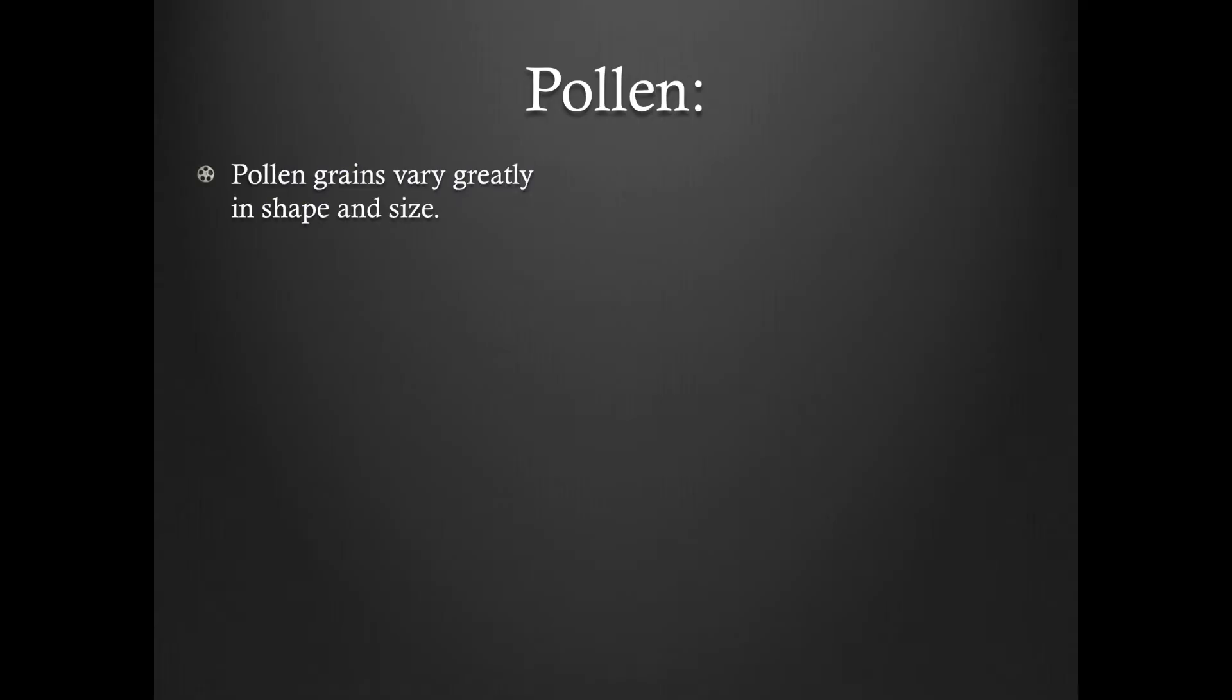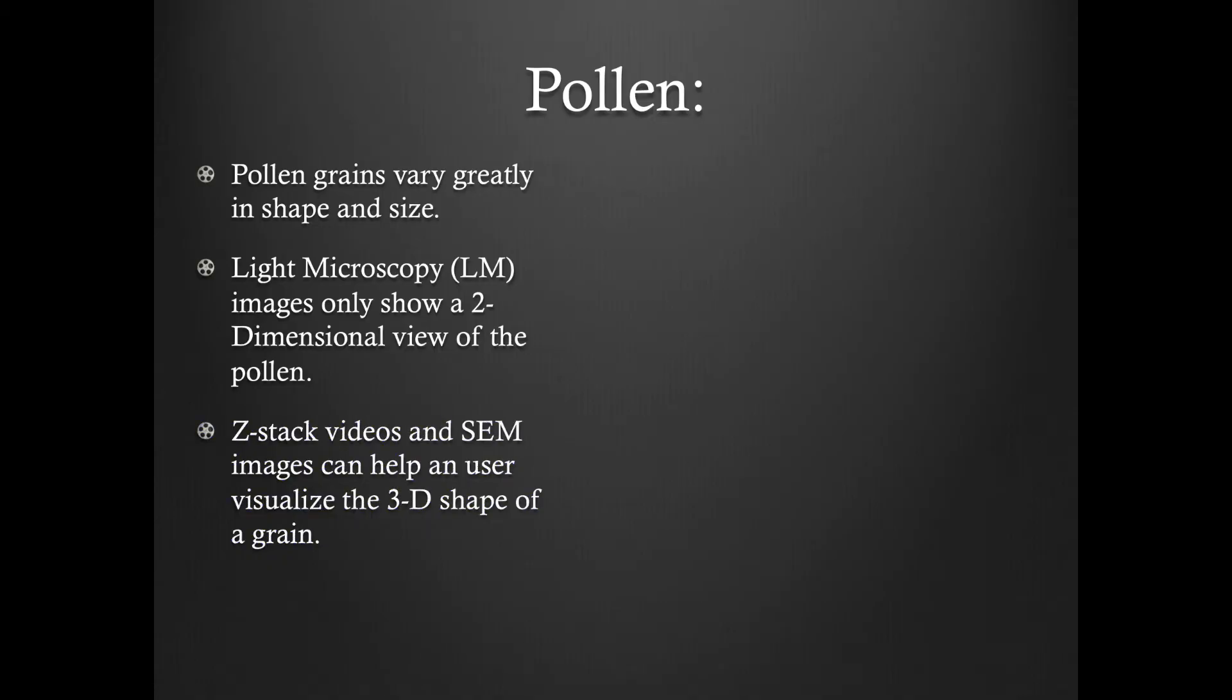Pollen grains can vary greatly in shapes and sizes. Light microscopy images provide a two-dimensional representation of the grain. Z-Stack videos and SEM images can help the user visualize the three-dimensional shape of the grain.